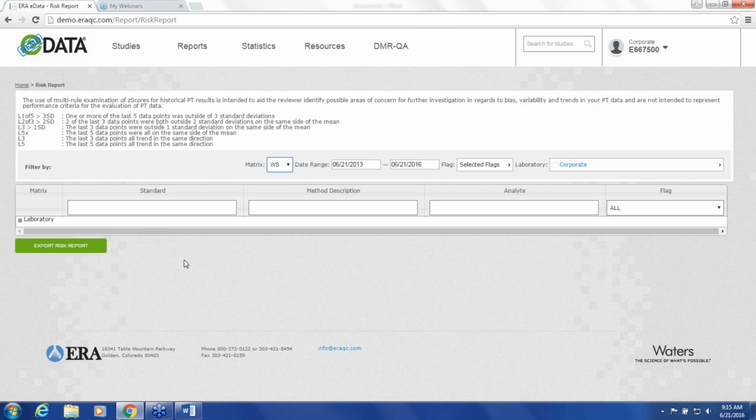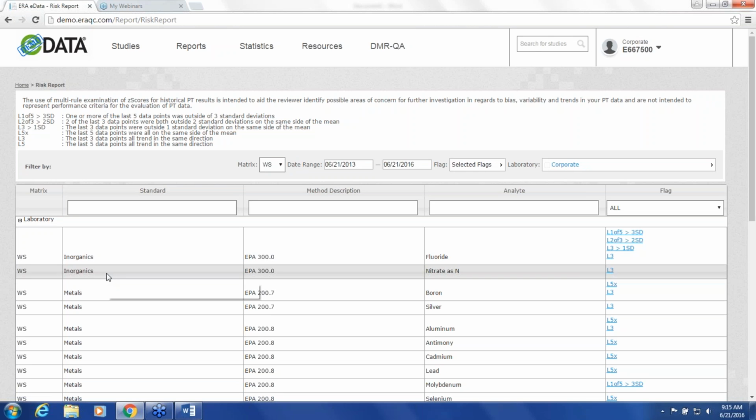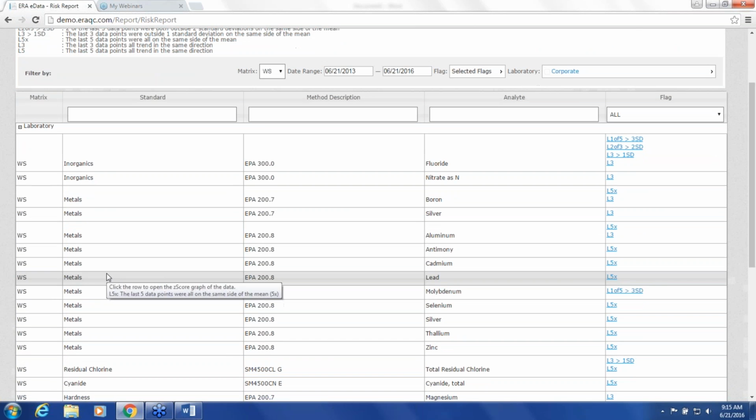All right, Jason, what am I doing wrong? Let's see, can you click on laboratory and bring it down some? Okay. I see. There we go. That's what I'm looking for. Thank you. You are welcome.